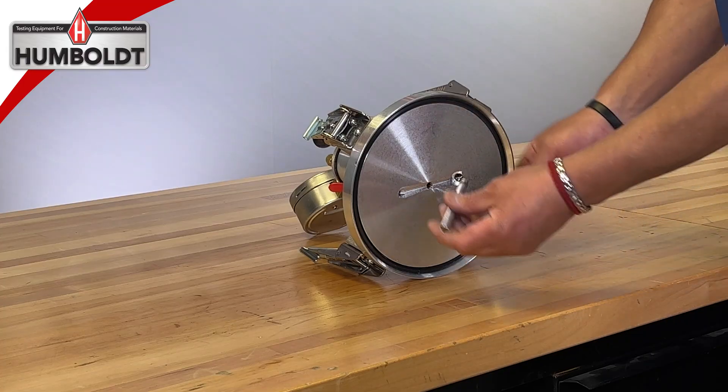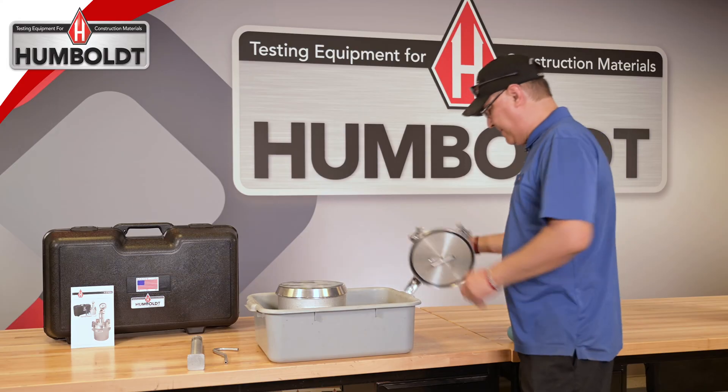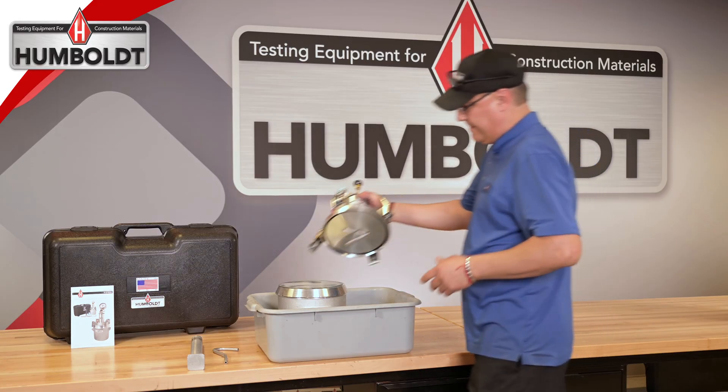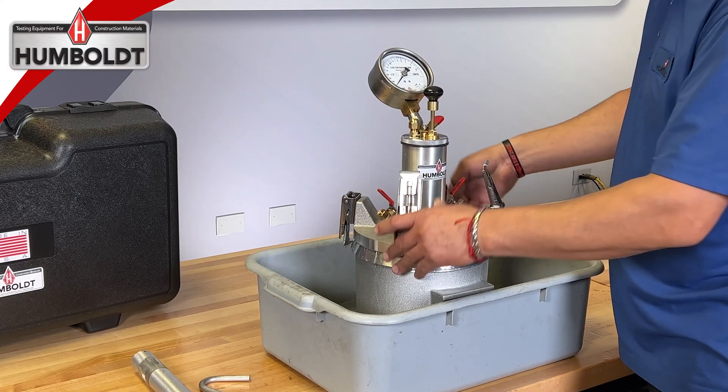Pick up the lid assembly and screw the straight calibration tube into the threaded pet cock hole on the underside. Position the lid assembly onto the base making sure it is seated properly on the lip of the base. This will ensure that the meter is airtight.